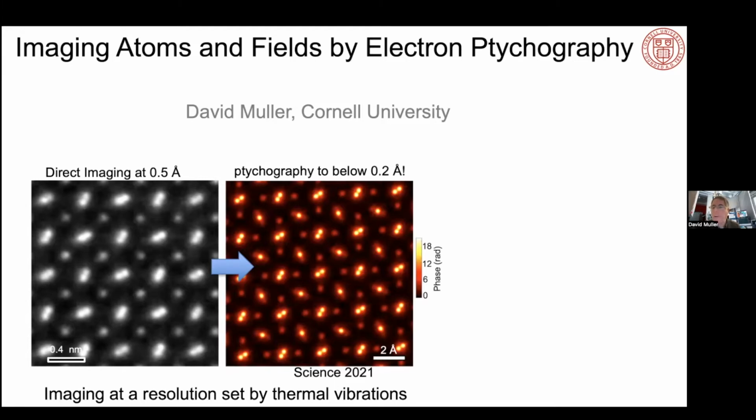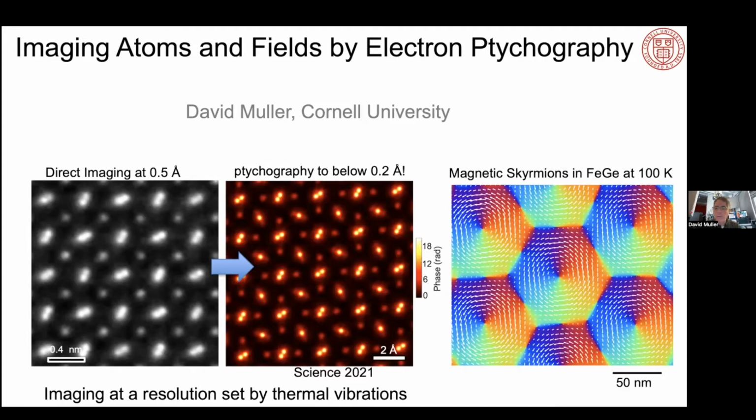a Debye-Waller factor in real space, which is of interest because if I get to a defect or a grain boundary, I can then see the Debye-Waller factor at an interface, which would be something very difficult to do from a diffraction experiment. And the ptychography itself has also made it possible for us to look at other things. In this case, I'm showing you a very pretty picture of magnetic skyrmions. So it's a magnetic texture imaged with ptychography. This is the induction field.